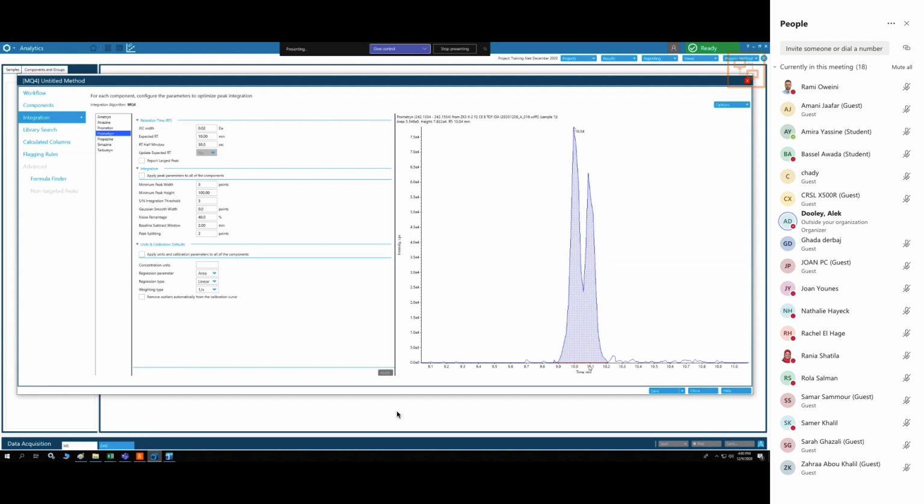And actually we know that. We saw examples of it in the lecture, right? We talked about that. Isomers are by definition the same mass and the same formula, but just put together differently. Hopefully there will be some difference only in the MSMS. So right now we don't know which way it is. One is one and one is the other. We don't know until we get to the MSMS.